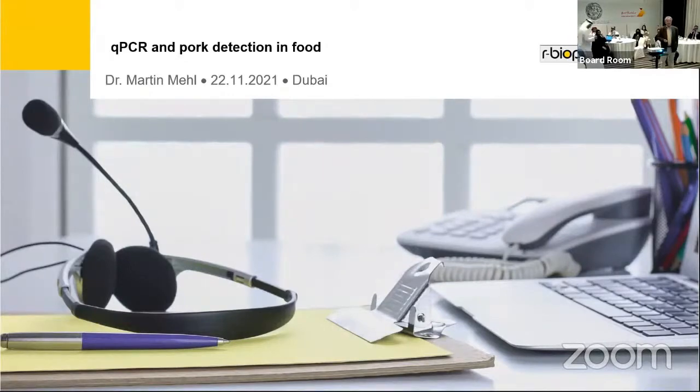So we are starting, and I'm delighted to tell you something about the application of PCR in pork detection, mainly for halal issues. As you can see in my working title, I will mainly speak about pork, but everything is valid as well for other species like horse, camel, poultry, and so on.